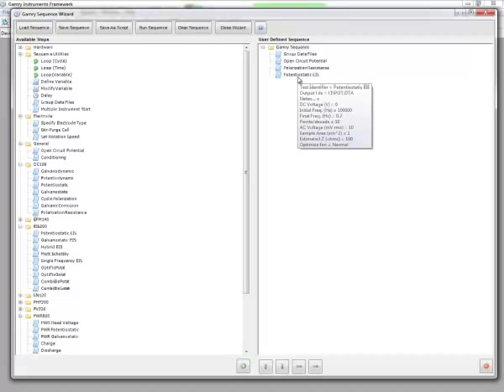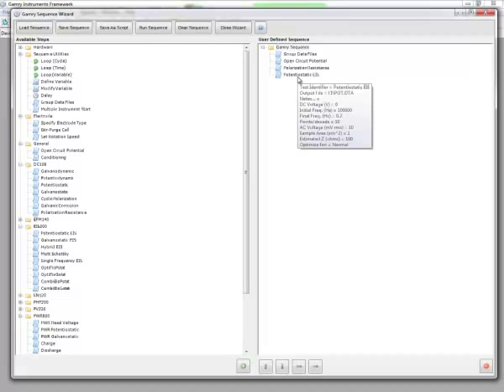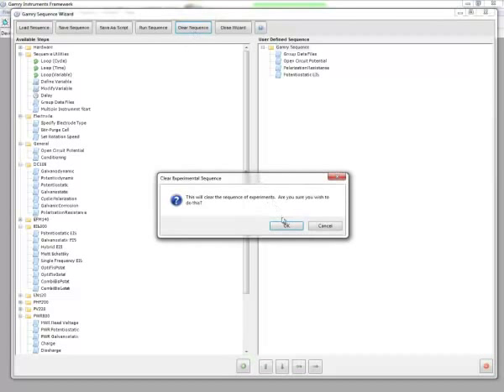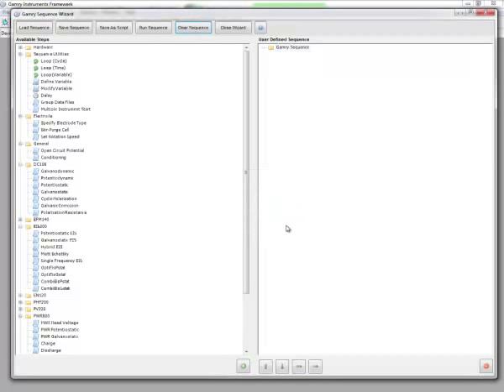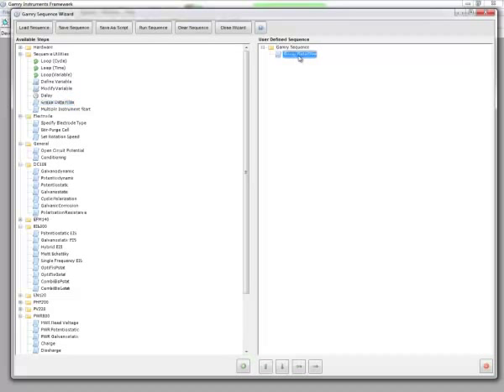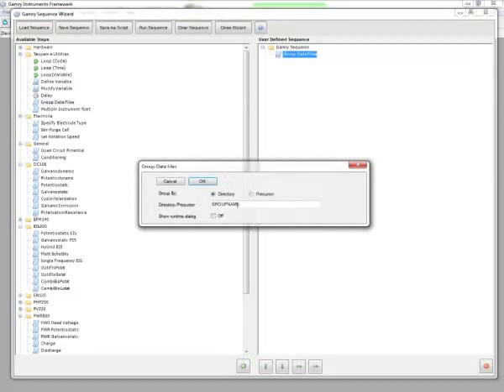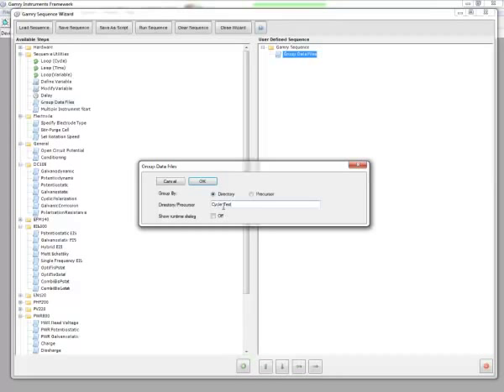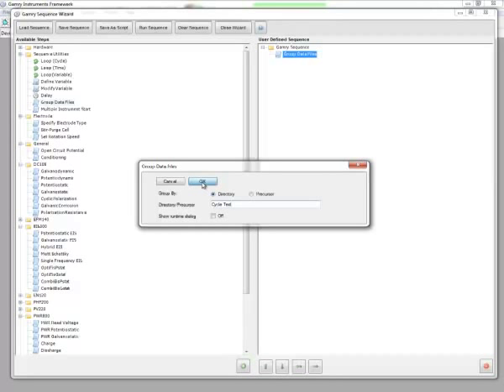This video is going to use the feature for looping. So I want to clear out the sequence, and now I want to set up a sequence. Initially, I grouped my data files so that they all fall into the same folders. Here I'm going to name that CycleTest, or LoopTest, or whatever you want to name your folder. Click OK.